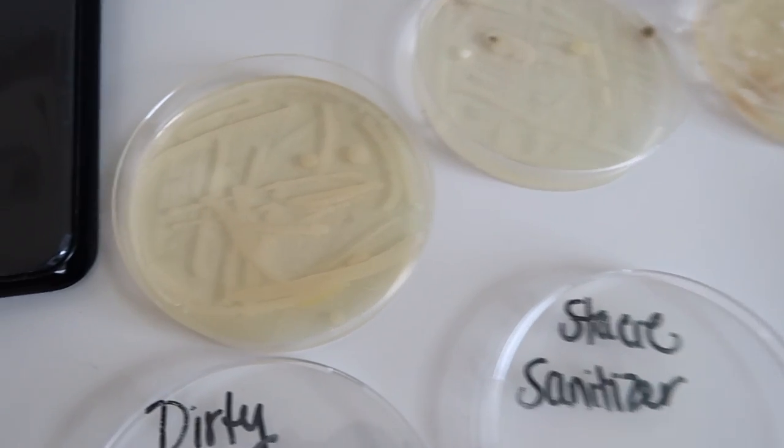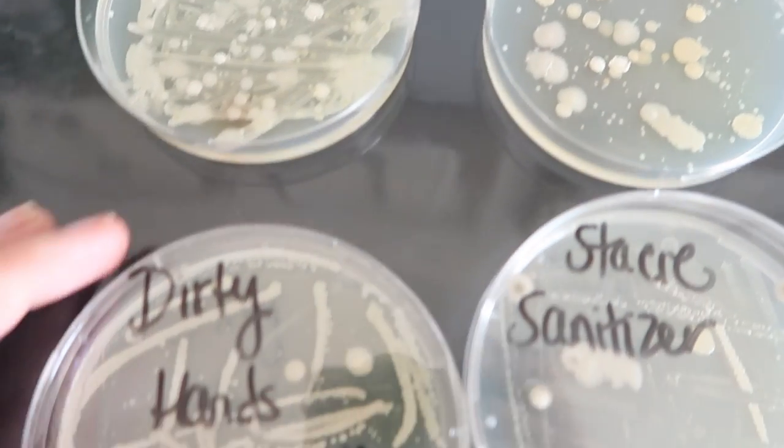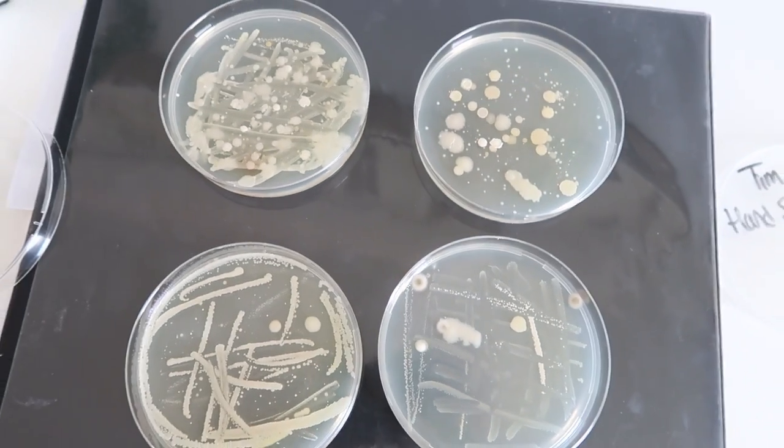The results were actually pretty shocking to me. I expected my husband's hands — the ones that used hand soap — to be a lot cleaner than mine, because he used antibacterial hand soap with warm water and physically washed the bacteria off. I, on the other hand, just used hand sanitizer which is 80% alcohol and also contains hydrogen peroxide. After examining the petri dishes, I found that his soap petri dish actually had more bacteria than my hand sanitizer petri dish, so it appeared as if the hand sanitizer killed more bacteria.